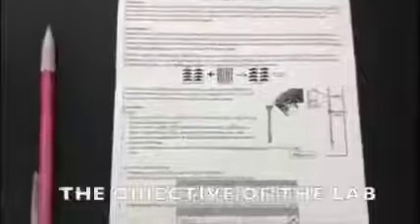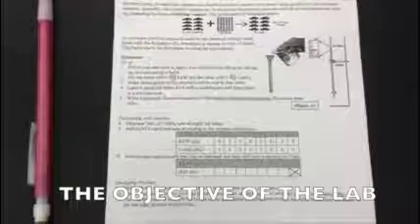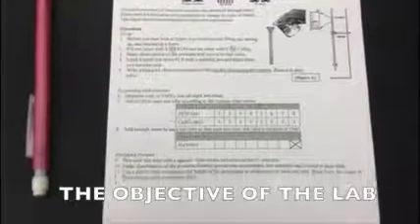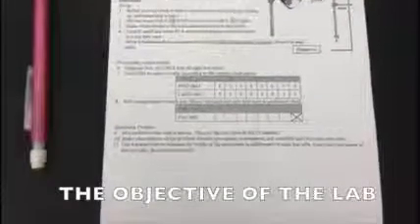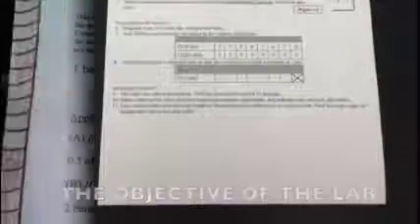The objective of this lab was to show that reactions do not always form the amount of products as shown in the balanced equation. We observed the reaction between two aqueous solutions and collected data on the precipitate formed.